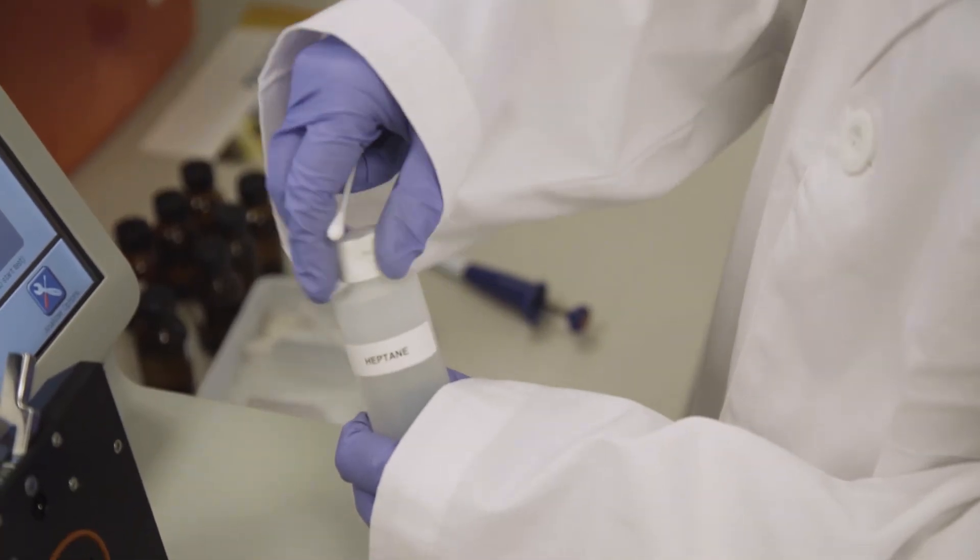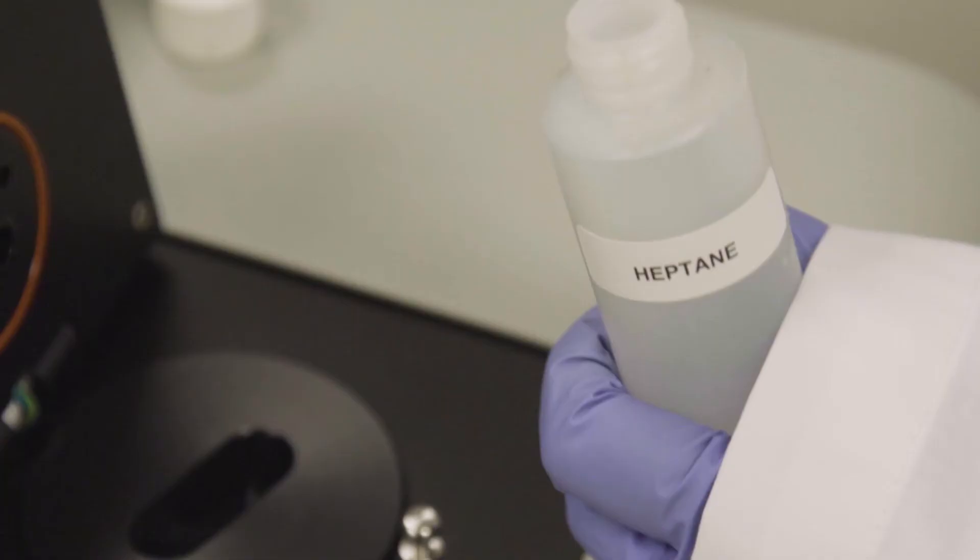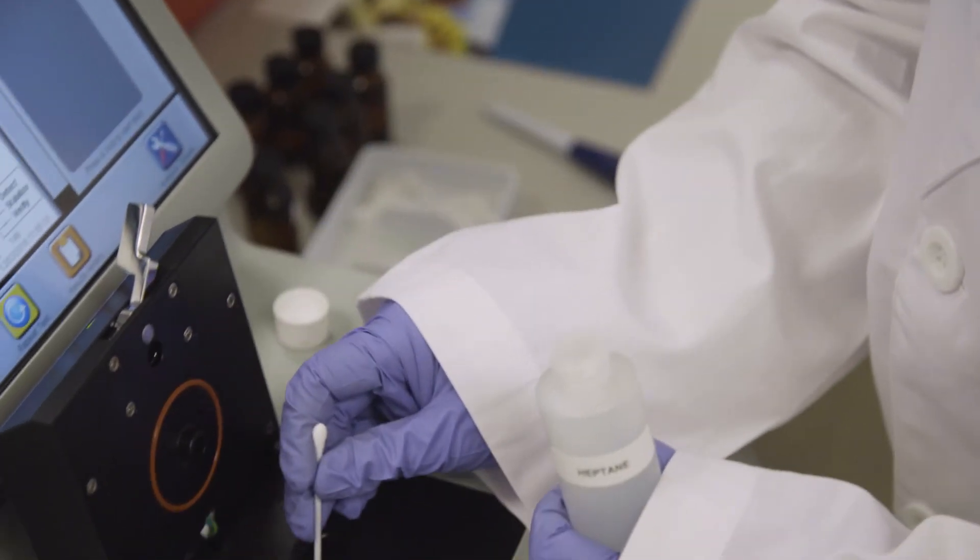Then soak a new cotton swab with solvent, preferably heptane, and gently swab around the inside of the sample cup's surface.